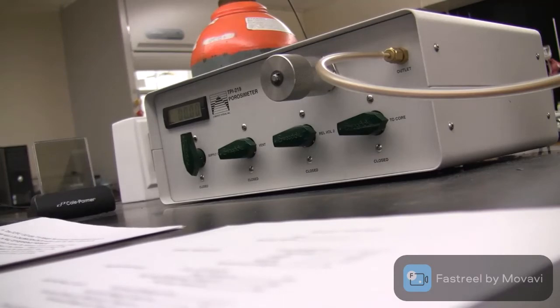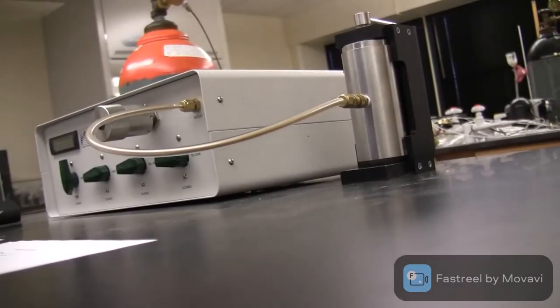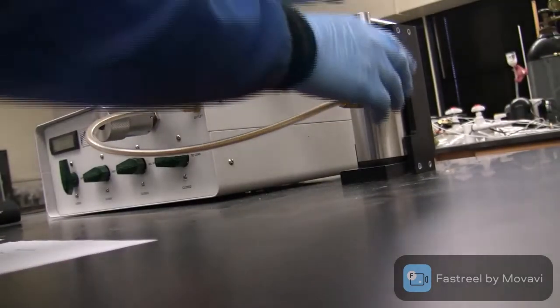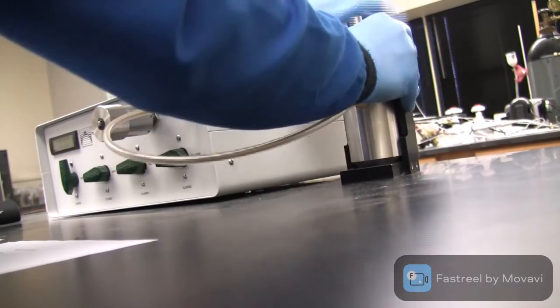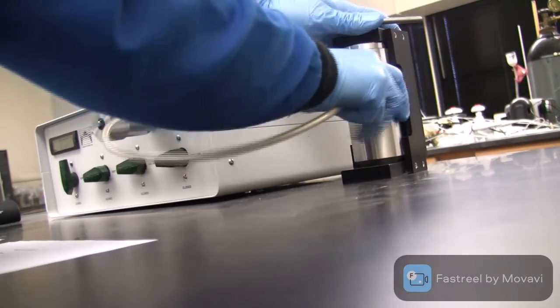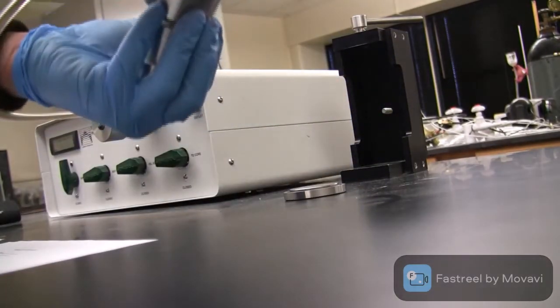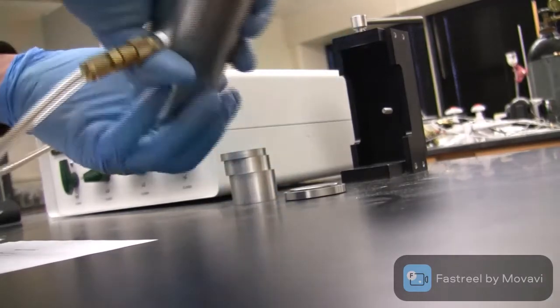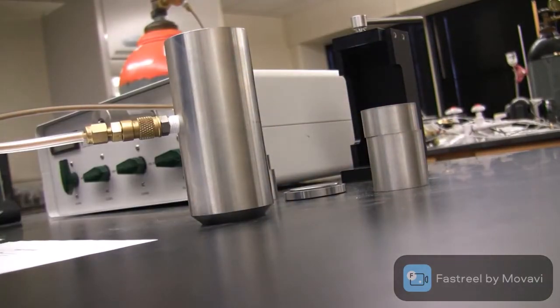Okay, so after that, when the pressure is 0, you can open your chamber that had your billets and take the billets out. After taking the billets out, let's bring our core.